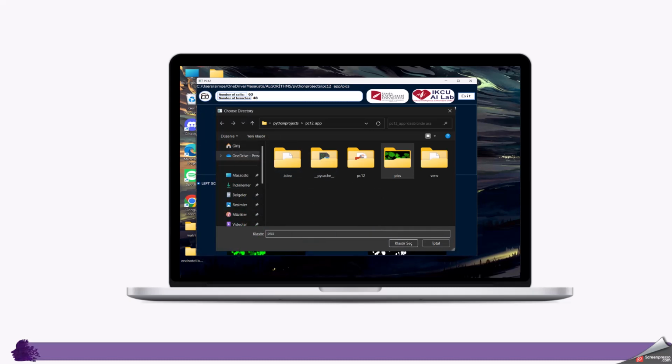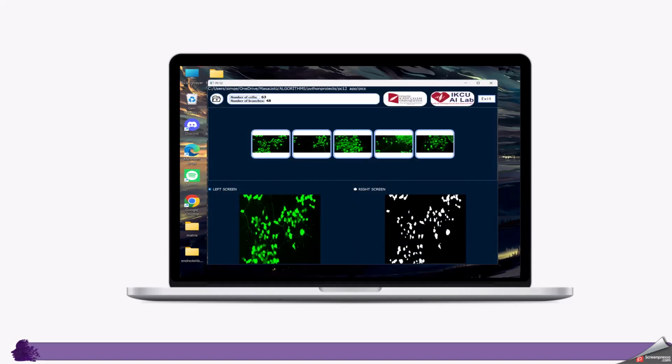After specialists log in to the application, they can select the image file by clicking the file button in the upper left. A PC12 image can be uploaded to the application through the file selection button on the main screen. The main screen is divided into left and right to locate the image. The detection process can be started via the upper image buttons on the main screen after uploading the image. After the button is pressed, the processed PC12 cells are displayed on the right side of the main screen, besides the cell count and branch count shown in the upper side of the main screen.